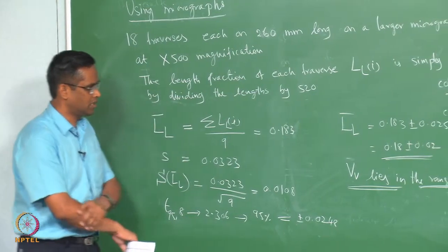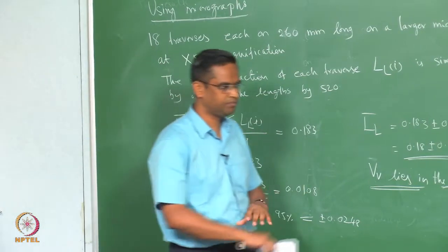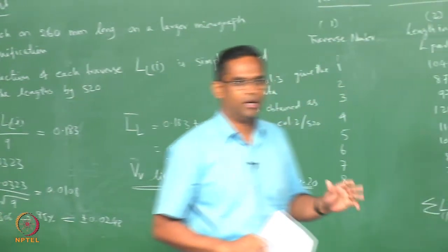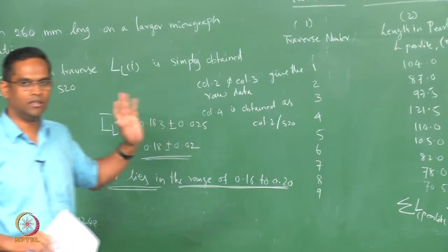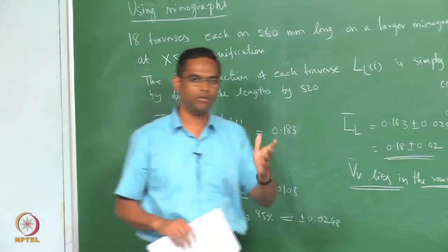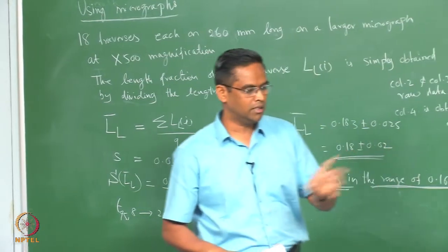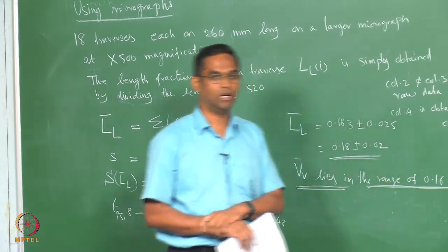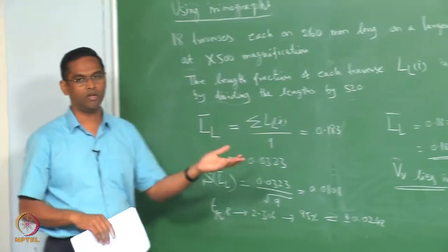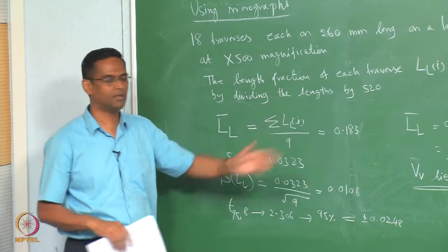What I have just demonstrated through this case study is that you may use a computer for calculating many of these, or you may use software readily available in your laboratory. Just by clicking the mouse button, you will get all these values, but you should know what that software does, which may involve some statistical analysis like this.